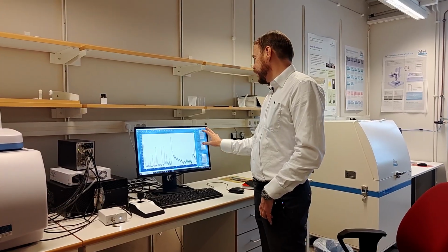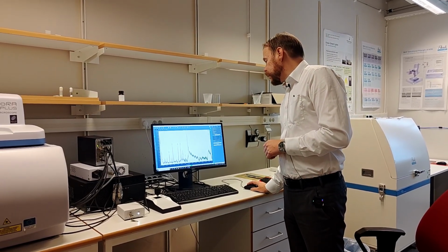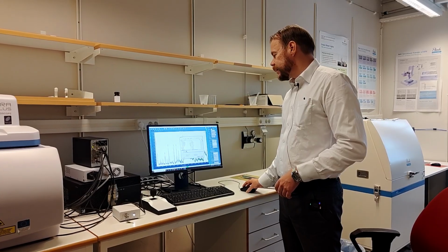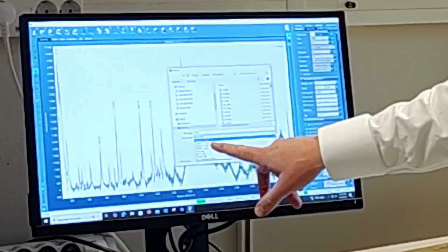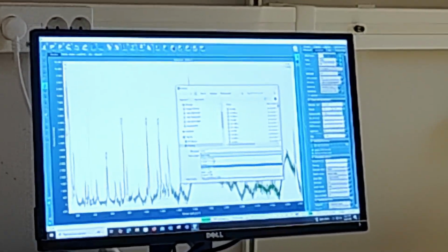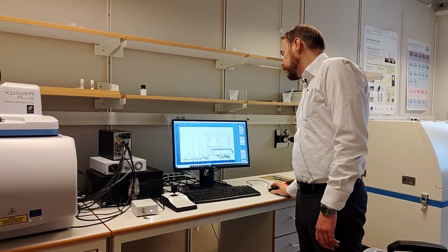When you have reached this, there is more: you can process the data, subtract background, do baseline correction and all these kinds of things. You can play with that yourself, I won't say more on that. What I can say is that what most people do, when they save the data, you have 2 options. The LabSpec 6 format, if you save it in that, then you can reload it in this program. I always do that if I want to go back and do some changes here, but I also save it as text files, because text is CSV data, comma-separated values, so then I can import it in other plotting software for publications. So that's what I always do.